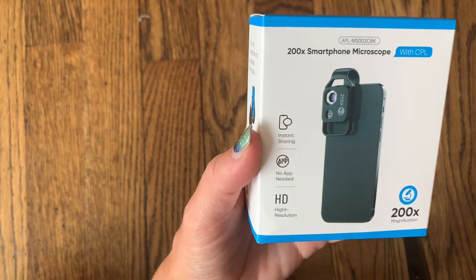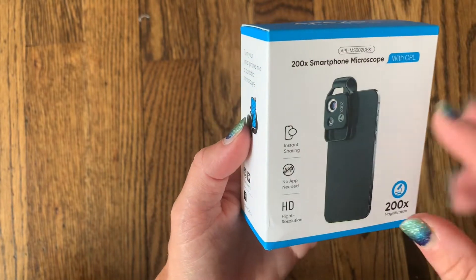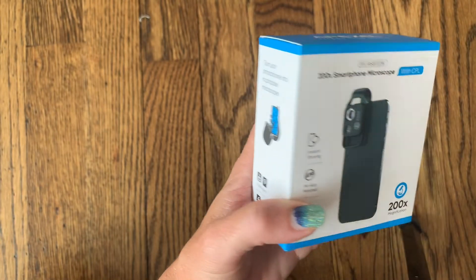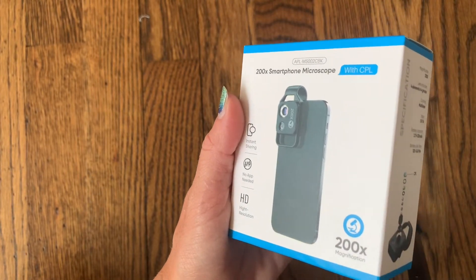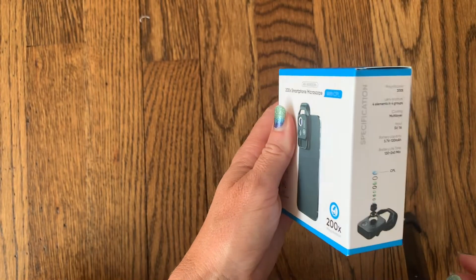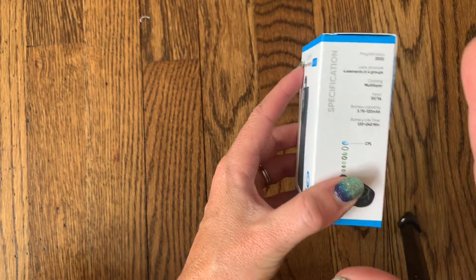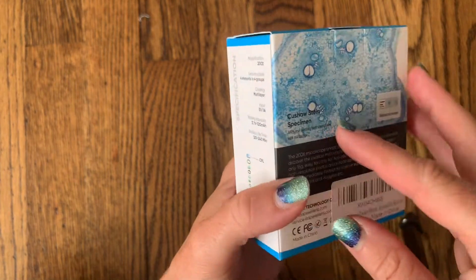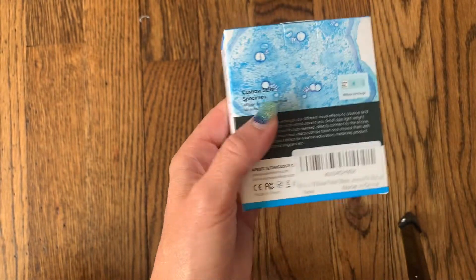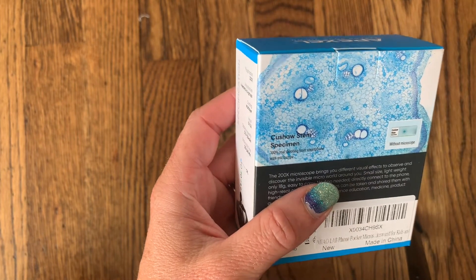You can just clip it onto your phone and it's ready to go. The clip is completely adjustable so it should fit any kind of phone, and you can instantly share using your phone camera just as you normally would, except with that 200x magnification. It also has two different levels of brightness so you can brighten up anything you're looking at and really get a clear picture. It also eliminates any reflection so you're going to get the true colors of what you're looking at without any glare.